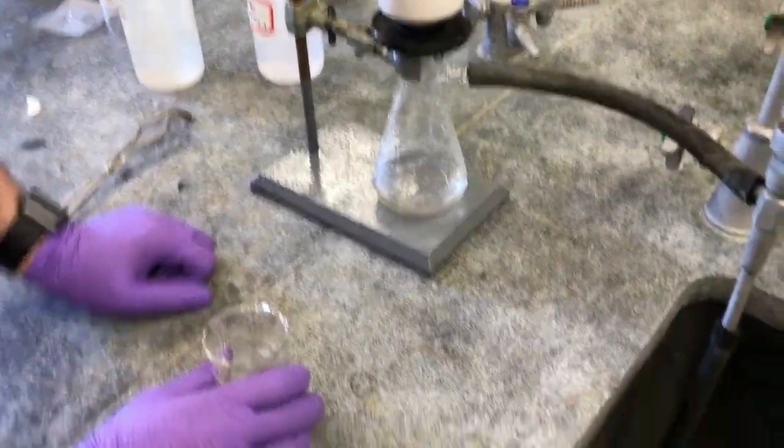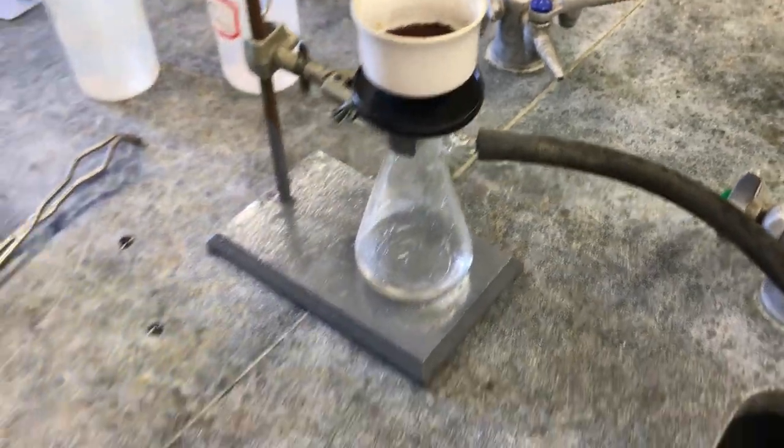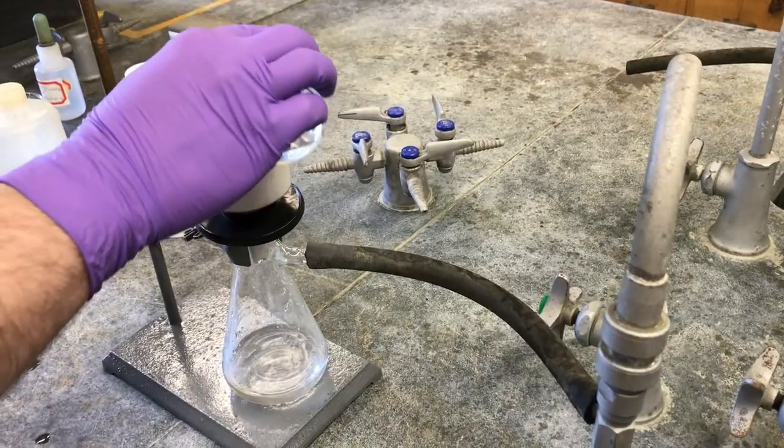So now that we've allowed all the water to filter into the bottom, we're going to be washing this 3 times with approximately 10 milliliters of acetone. Just to wash, you want to get it all around the sides.